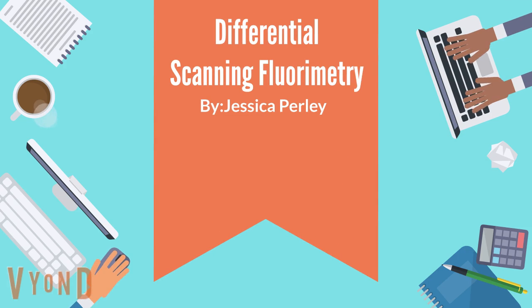Welcome to my presentation on a biochemical technique. I will be presenting on the details of differential scanning fluorimetry, DSF, and how it can be used in science.